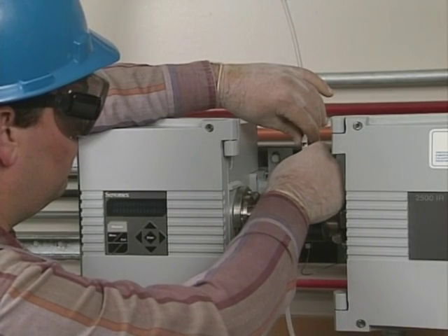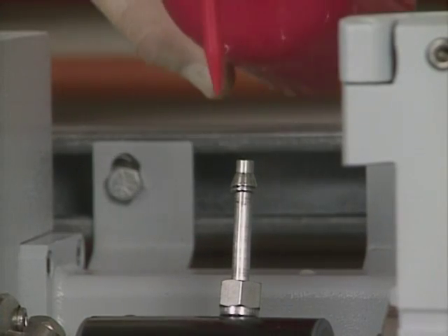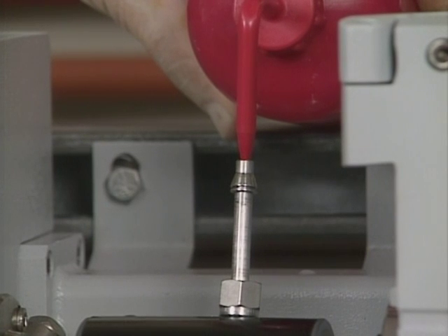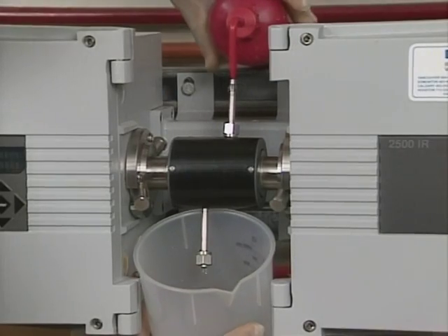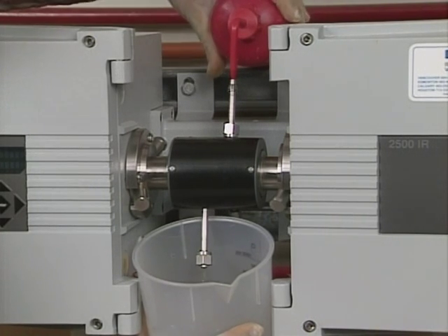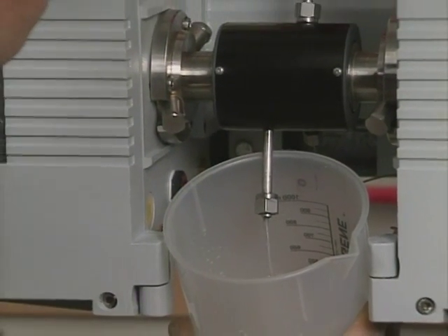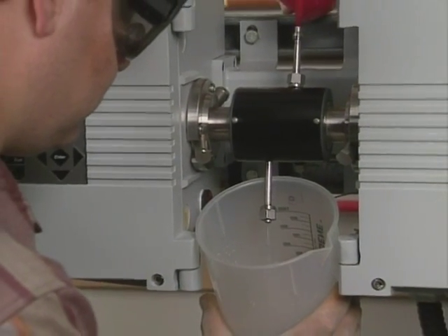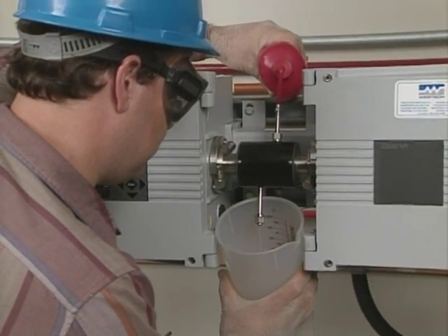With the sample cell in the analyzer, disconnect the process connections. Flush the sample cell with a cleansing solution, such as isopropyl alcohol or methanol. Ensure that the cleanser is compatible with the cell windows and window coatings. The cleanser should also be compatible with the process stream in case there are traces left in the sample cell. Carefully check the solution as it's washed out of the sample cell. If no contaminant washes out, try the procedure with a different cleansing solution.